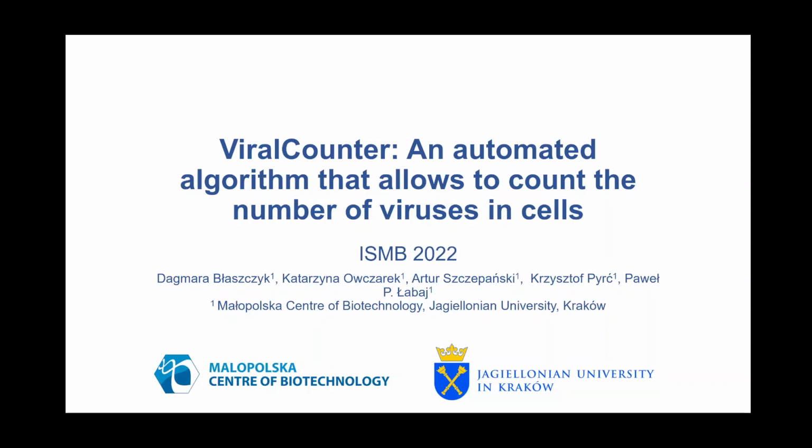Hello everyone, my name is Dagmara Błaszczyk and today I would like to present you my project, whose topic is ViralCounter, an automated algorithm that allows counting the number of viruses in cells.